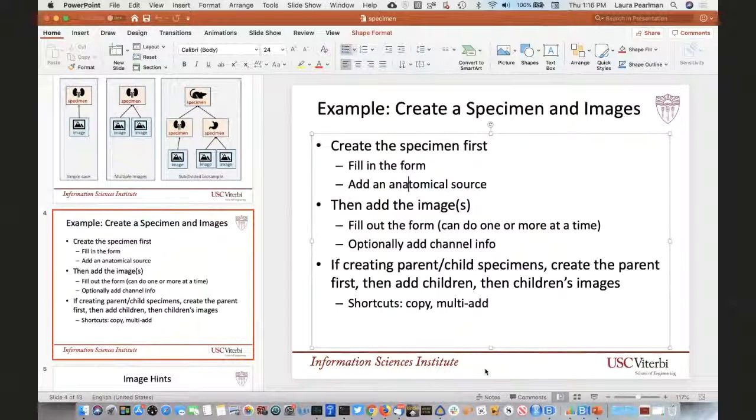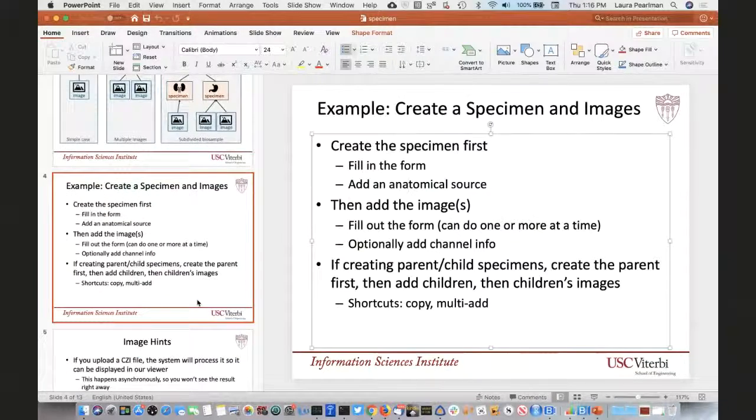Right. So for the age, I think we're going to use the chronological age because the stage is not sufficient to address that issue. I think so far we advised you in the past to use the chronological age, so that still holds. However, if you want to add information about where the organoid line is from, I think we still try to standardize on that. Yeah, I saw there was somewhere that there was a drop-down selection for line, so that's okay. It was just the age, but that makes sense to use chronological age.